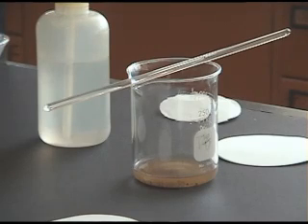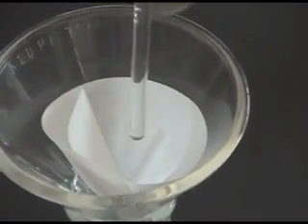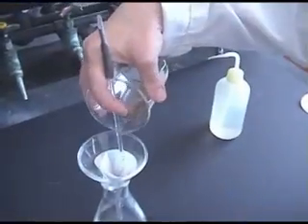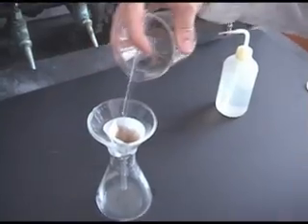Let the solution containing your solid settle until it's resting on the bottom. Slowly decant the solvent into the funnel using a glass stir rod. Slurry the remainder of the mixture, and then with the glass stir rod, decant the mixture into the funnel, being careful not to touch the funnel with the glass stir rod.